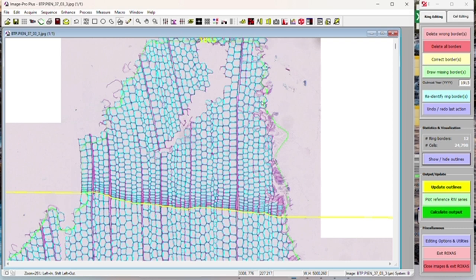So we know that all of these dates line up with what I dated in the preview images, which I think, Matt, you and I did at NADEF 6 years ago. Or maybe, no, that was Will and I, I think. I don't know. It took a long time. I remember that.